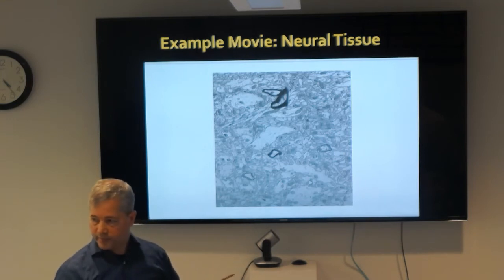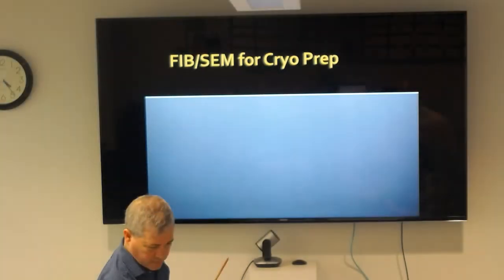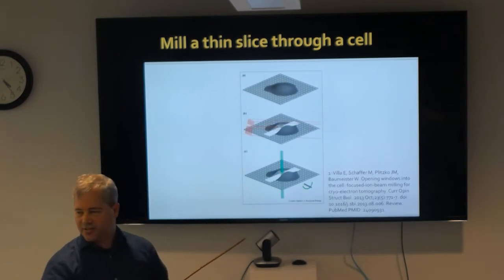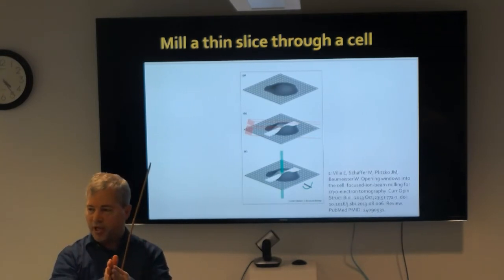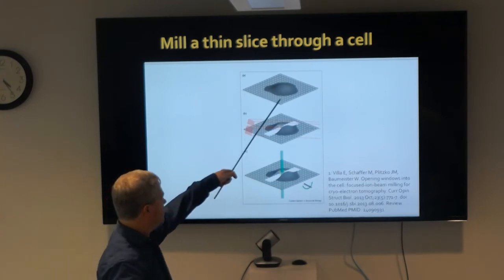And then a second question, in the next slide, how was the cell dehydrated? Oh. Next one. Oh, and the cell actually, there should be water around here. This is just a diagram from the paper. Basically you have the cell grown on a grid. You freeze it by blotting using the standard technique of a Leica or a Vitrobot, so you blot most of the water off, and then plunge freeze that grid, and you are left with the cell with a little bit of water around it.